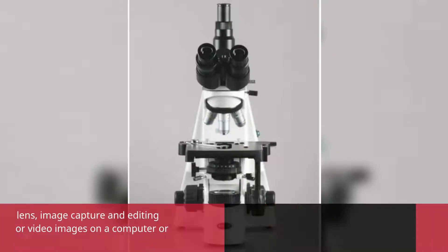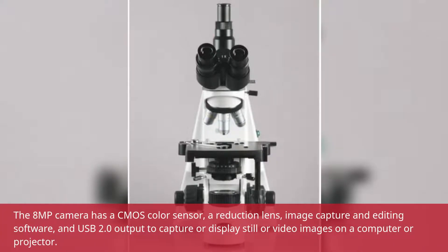The 8MP camera has a CMOS color sensor, a reduction lens, image capture and editing software, and USB 2.0 output to capture or display still or video images on a computer or projector.